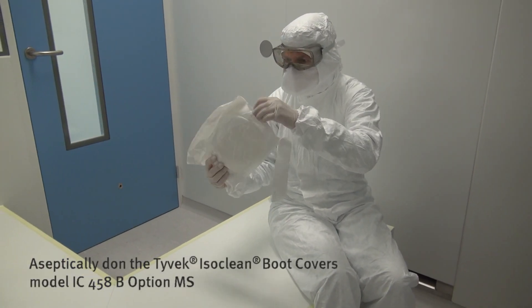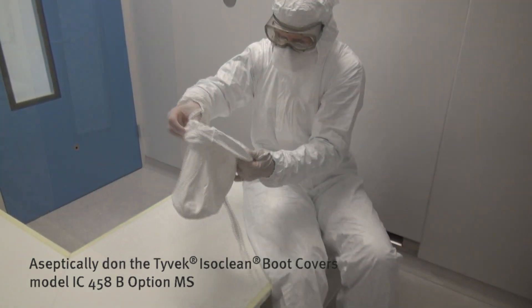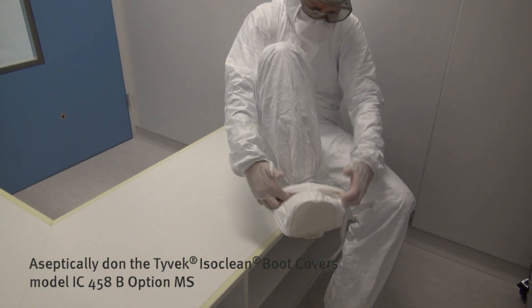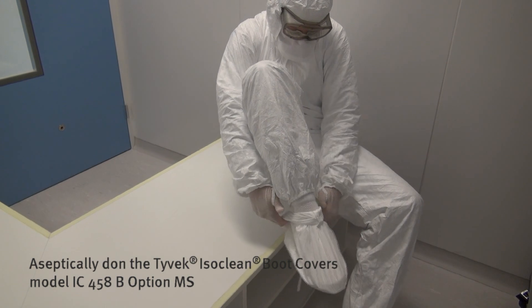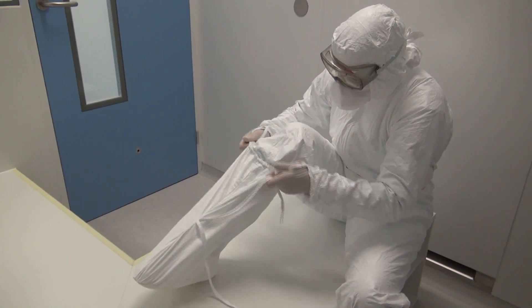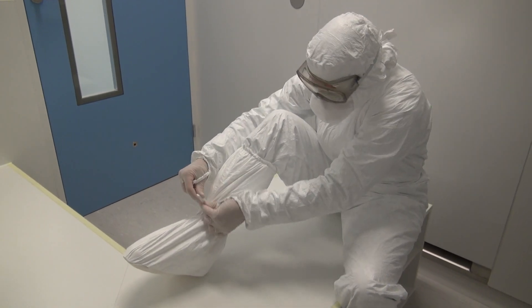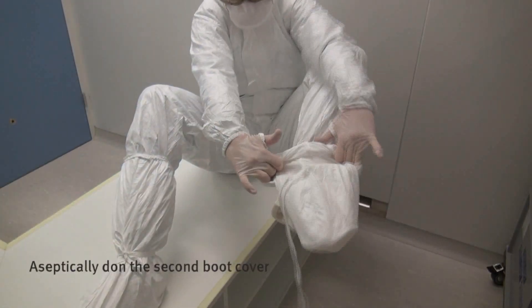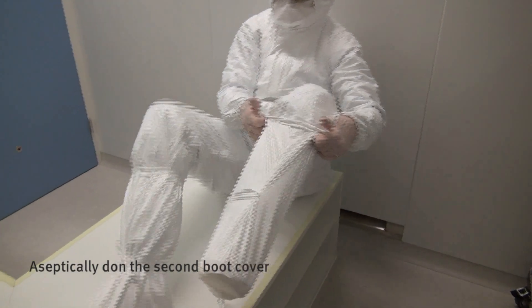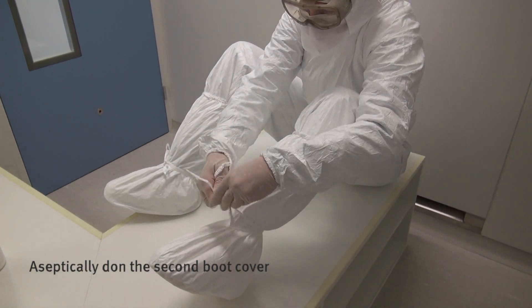Now, don the boot covers on the so-called dirty side of the bench. Avoid contact between your gloves and the outside of the boot covers with your socks, clogs and undergarment. To avoid contact, point your thumbs outwards. Tie the ribbons firmly. Aseptically don the second boot cover, pointing your thumbs outwards, and tie the ribbons firmly.